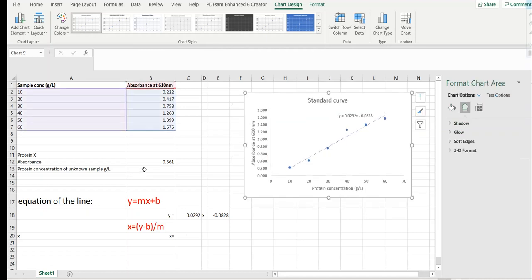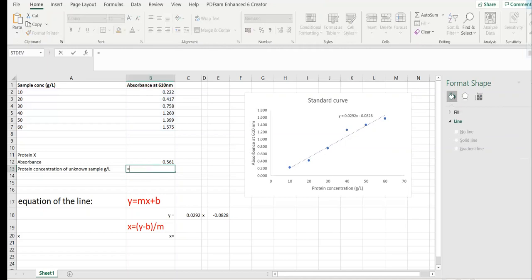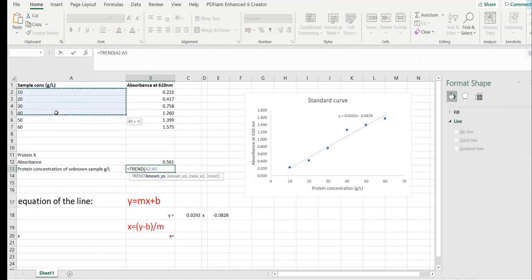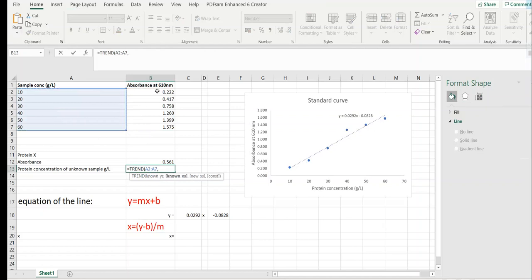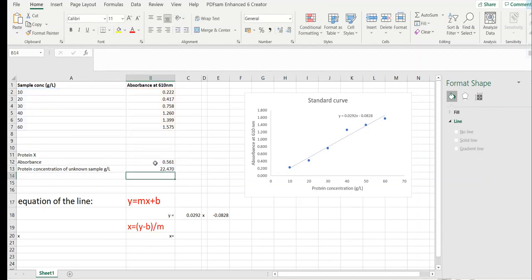So one way to find the protein concentration is a simple one where you put equal sign, type trend, double click on trend, select known protein concentrations, comma, select the absorbance of your protein of interest that is measured through an assay. Close the bracket and press enter. So this is the protein concentration of unknown sample in grams per liter.